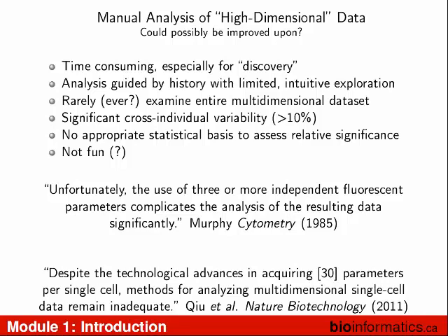In that case, what you have is labels on your two samples. And what you want to do is find some cell population that best explains that difference. And we have tools that can do that too. But the approaches and the way you have to analyze the data are completely different for those two kinds of outcomes.